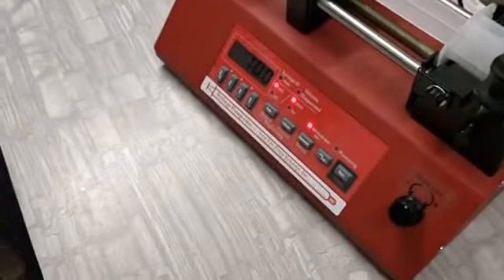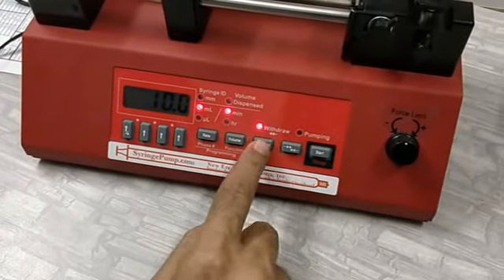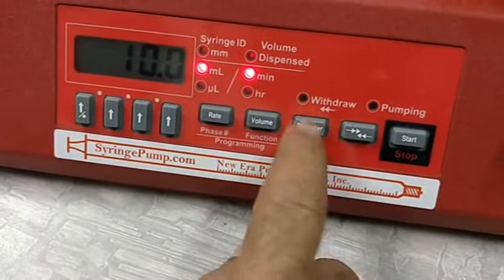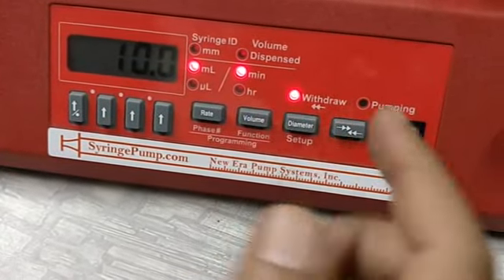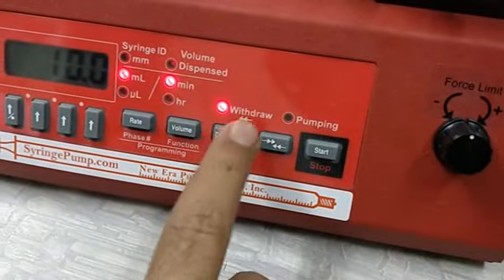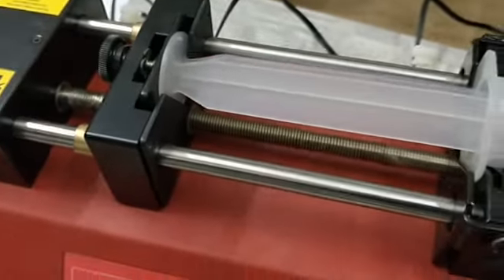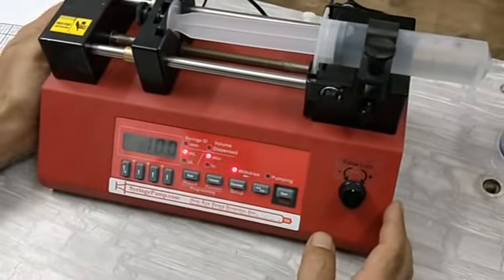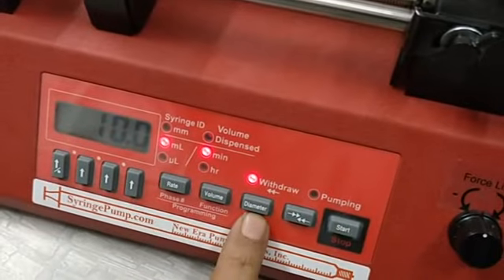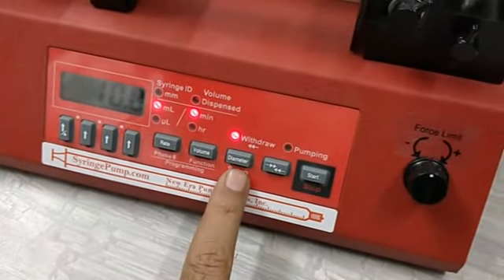Now we are coming to the operation. You can see there are four arrow keys and buttons for rate, volume, diameter, and a back/forth arrow that decides whether the pump infuses or withdraws. Pressing it once enters infusion mode; pressing again enters withdraw mode. Holding start/stop for longer in withdraw mode will perform the purging function, and releasing it stops immediately. The first important thing is to enter the syringe diameter, because with the diameter the pump calculates the correct speed to deliver the accurate volume — it calibrates the volume using the diameter.